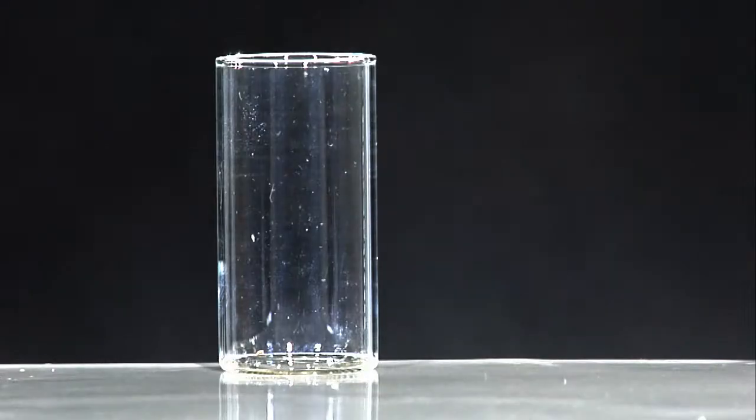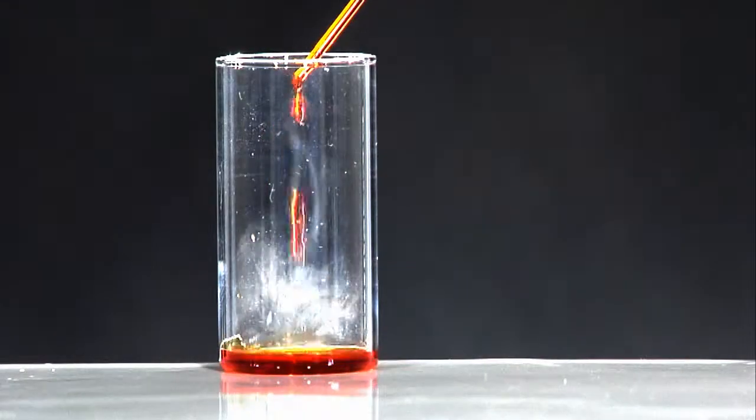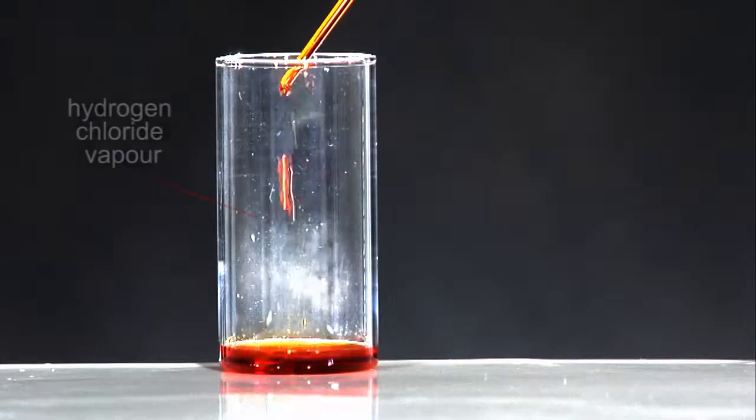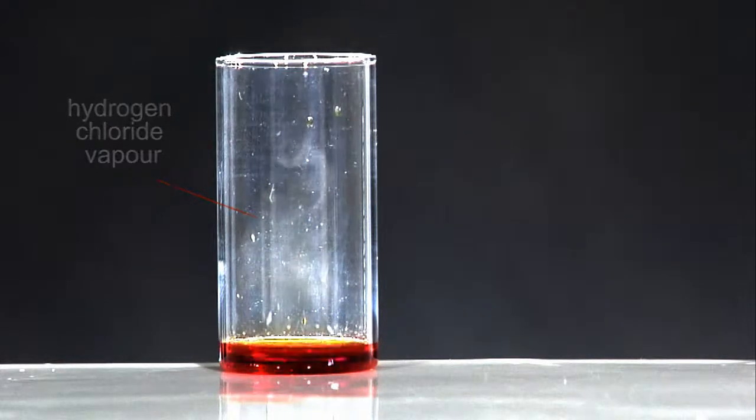Disulfur dichloride is an evil-smelling yellow-orange liquid. It reacts immediately with moisture in the air, forming a number of products.